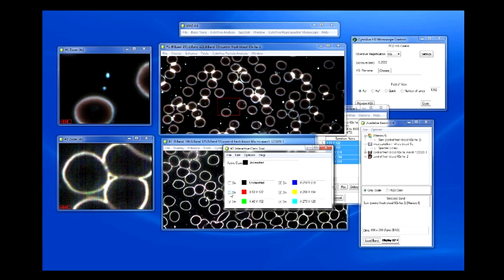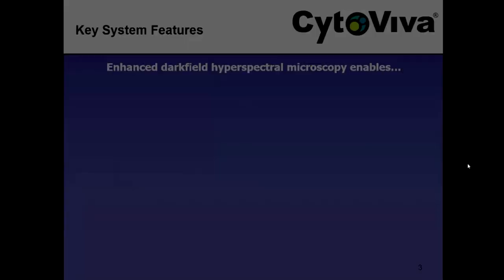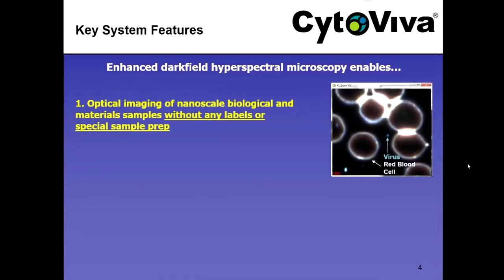That demonstrates just one principal feature of hyperspectral imaging — the mapping algorithm — showing the ability to map viral nanoparticles in a whole blood sample. Importantly, this whole blood sample was not altered in any way: no fluorescent labeling, no special sample preparation like you would expect for electron microscopy. That's one of the distinct advantages of this capability. We can do optical imaging of nanoscale biological samples without any labels or special sample prep.